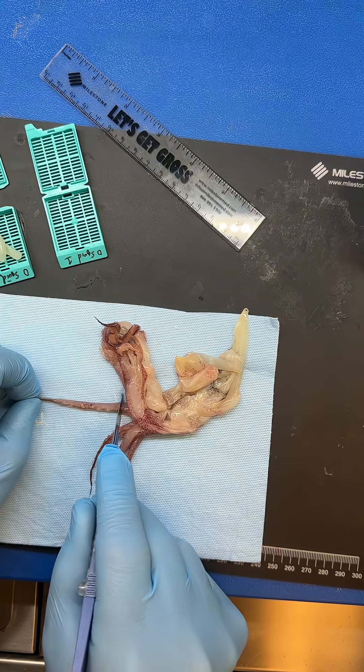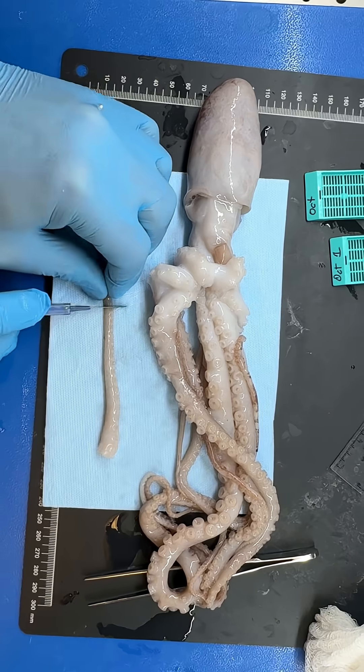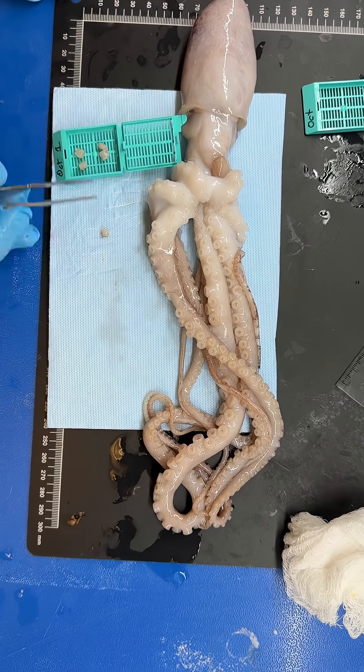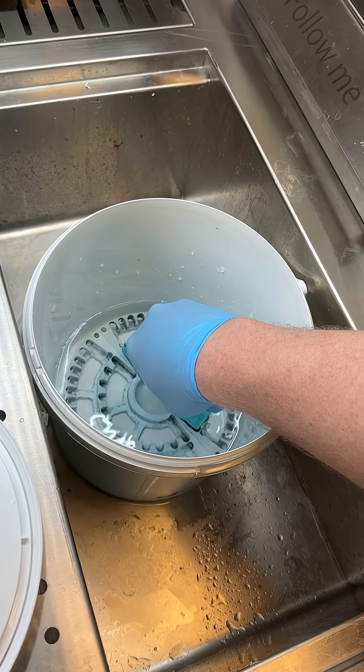The first step was grossing, and this is kind of where things started to go wrong. The squid was totally fine — it was already dried — but the octopus was literally disgusting to gross. No pun intended. We won't go into too much detail, but let's just say we had to cut most of the footage. It was actually a little traumatizing.